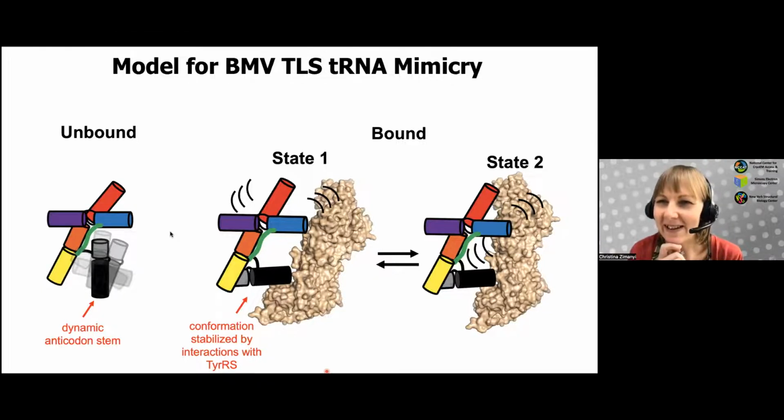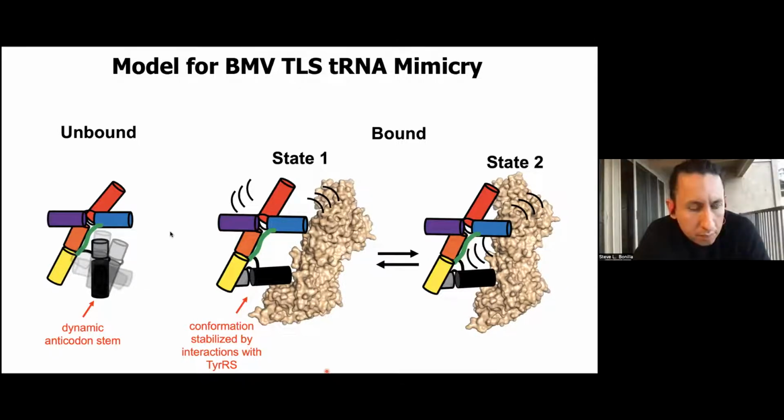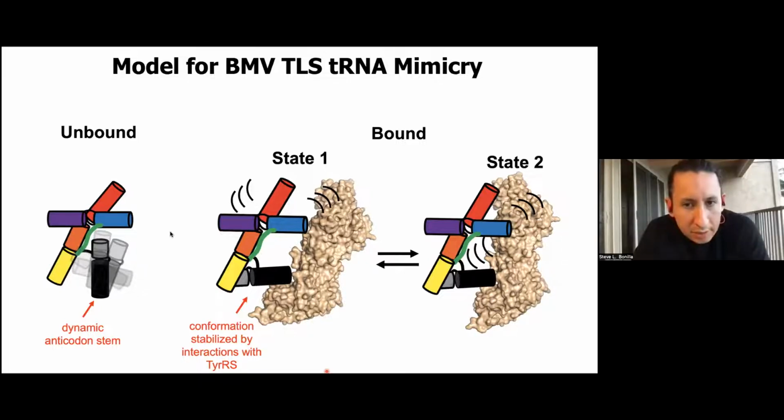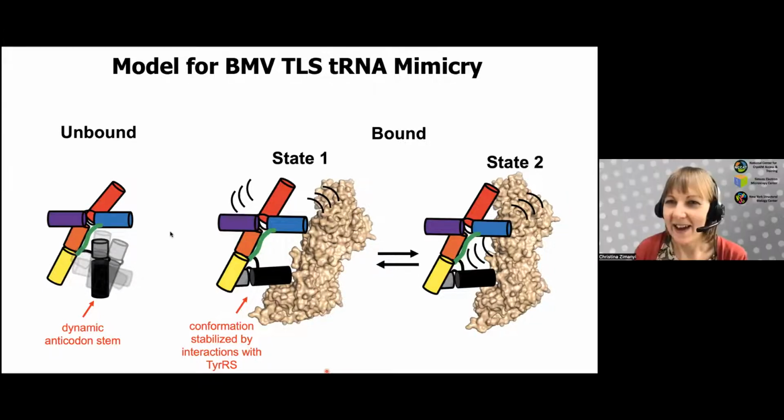Samuel is asking, even though you have good contrast, did you still use a phase plate or energy filter for the data collection? The data has an energy filter, but we did not use a phase plate. So no phase plate.